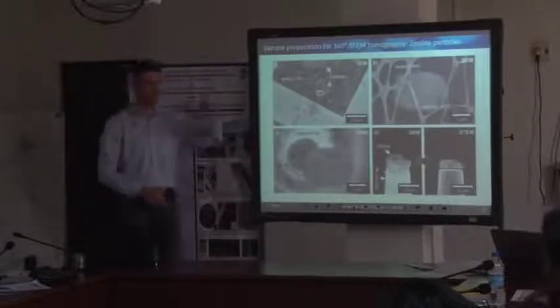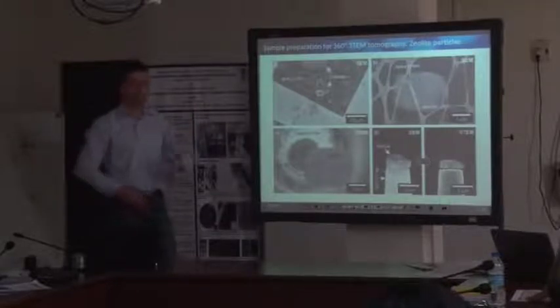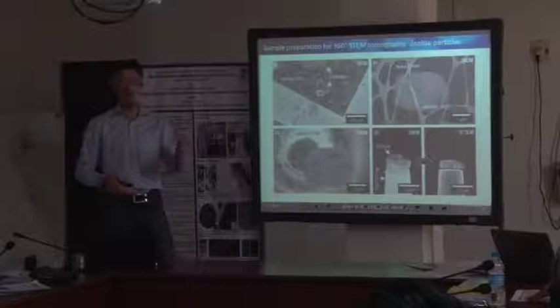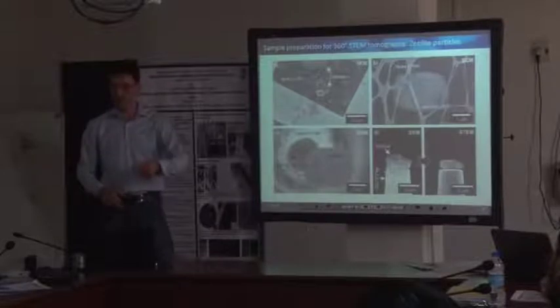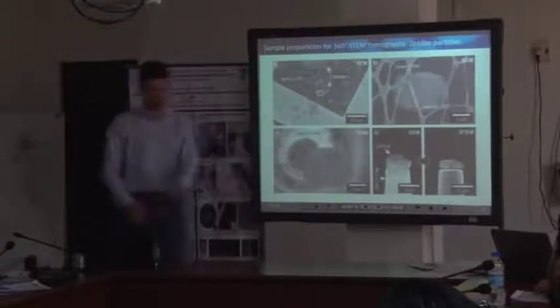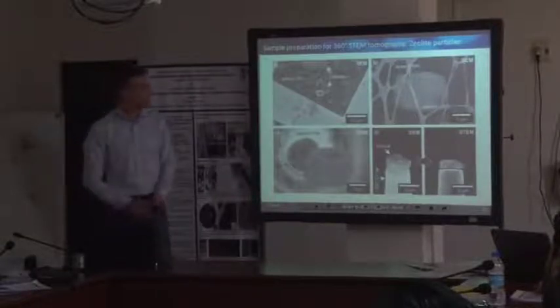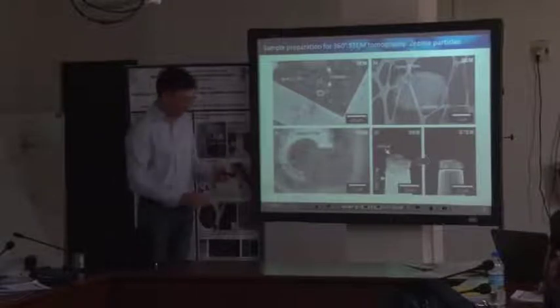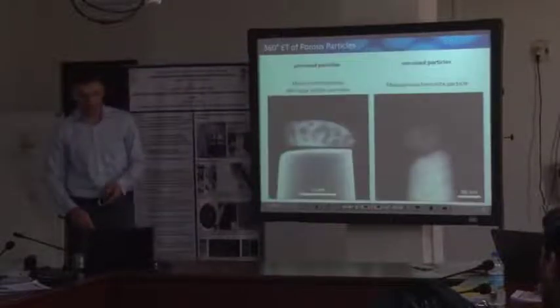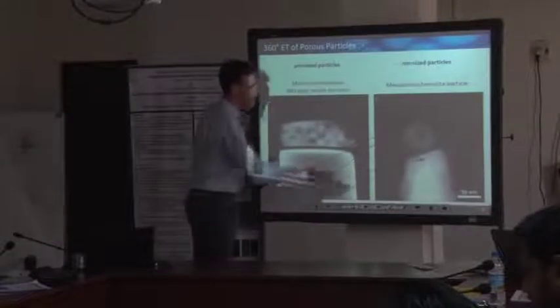The grid is just clamped in a nano manipulator, where you can use almost anything. You just need a steady position, and you have to move it in X and Y because you want to have it somewhere under your electron beam to identify one of those particles. And then you can just use the stage to approach the sample and pick your particle up from the support. And this works quite well. So this is an individual particle.